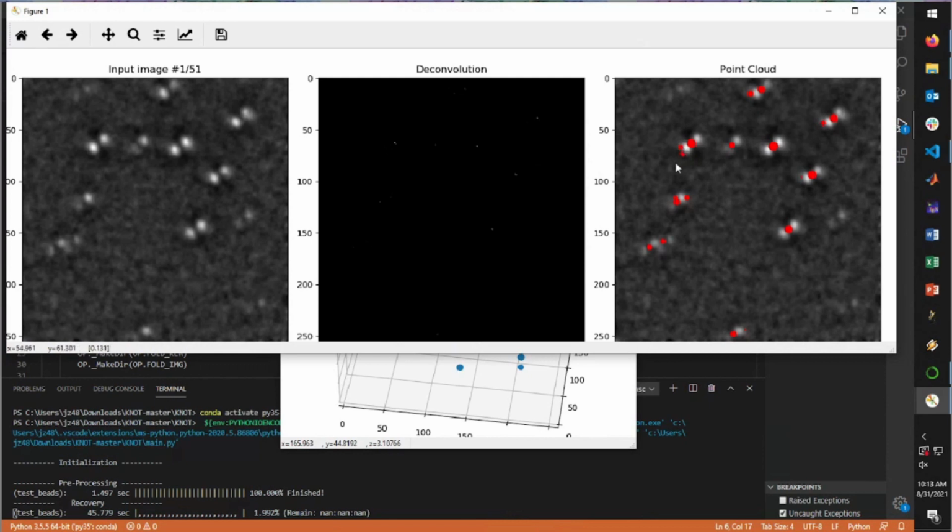You may note that some of the double helix point spread functions were either not captured, and some lobes have multiple localizations. The multiple localizations are due to the fact that one lobe is more intense than the other, and the best way for ADMM to represent that without compromising the reconstructed image is to attribute many low confidence localizations to that lobe in a circle. In extreme cases, this will become apparent, and it is a difficult problem to fix. A fix, however, is in the works, and the GitHub will be updated when it is complete.